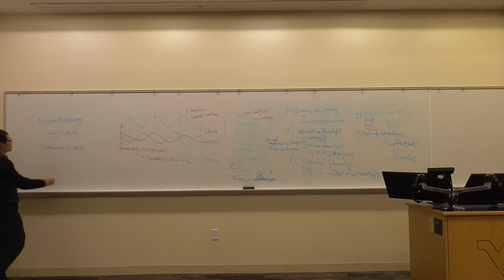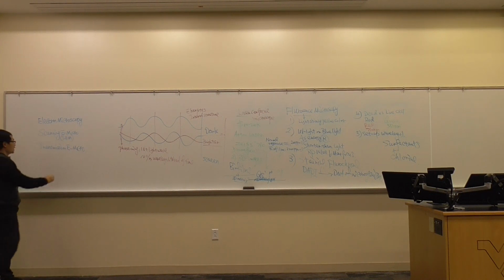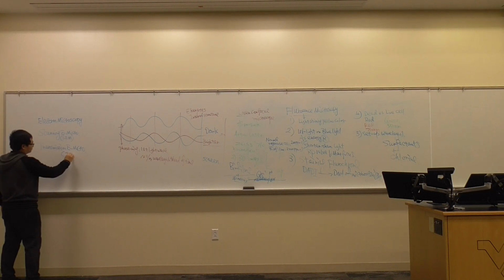The scanning electron microscope, we just use the acronym SEM. The transmission electron microscope, the acronym is TEM.